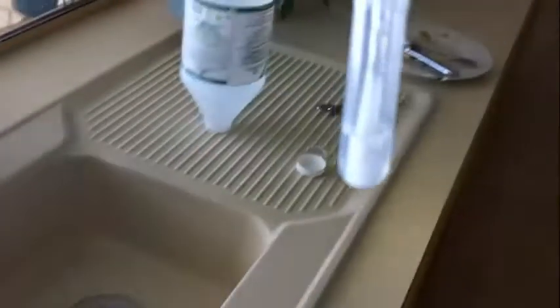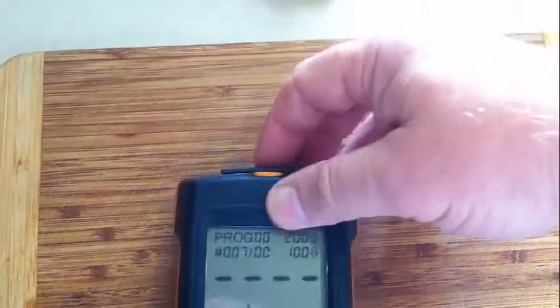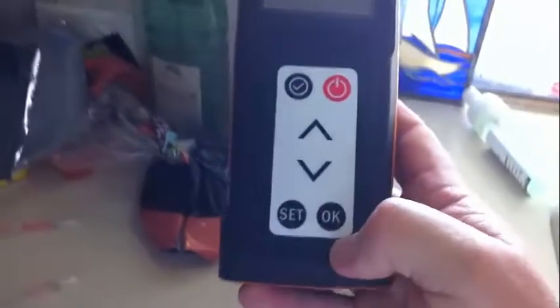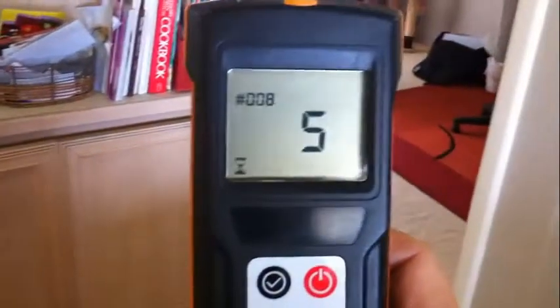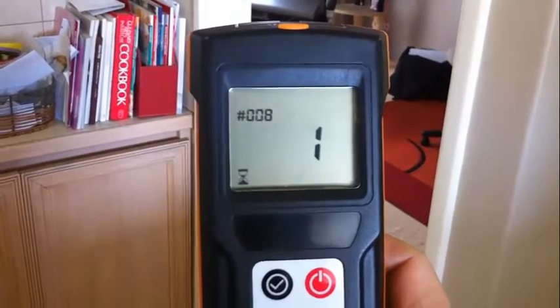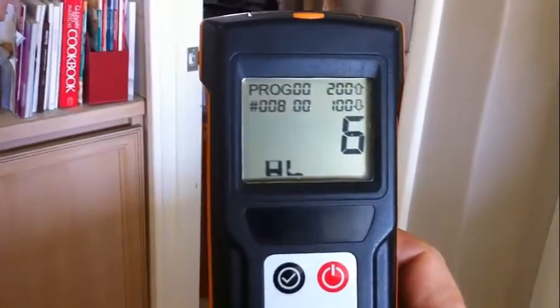Here we have the unit and we're going to crack that and give it a good squeeze. Now we should be able to see all of the liquid at the bottom there. Give that a good shake — shake it around, shake it up and down — make sure you get all of that onto the actual unit itself. Then we pop that in here, and that is now ready. Press the OK button. And that's actually very good — that's really a very, very good ideal result.